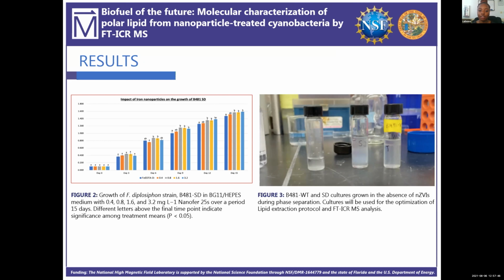We used online nano liquid chromatography coupled with ESI FTICR-MS using 21 Tesla to visualize the nanoparticles and also to see the compounds that are in the samples. Nano LC improves the electrospray ionization efficiency, and when combined with FTICR-MS can significantly extend the lipid coverage. Then we will search against lipid libraries to confirm lipid identities and use tandem mass spectrometry to explore them.